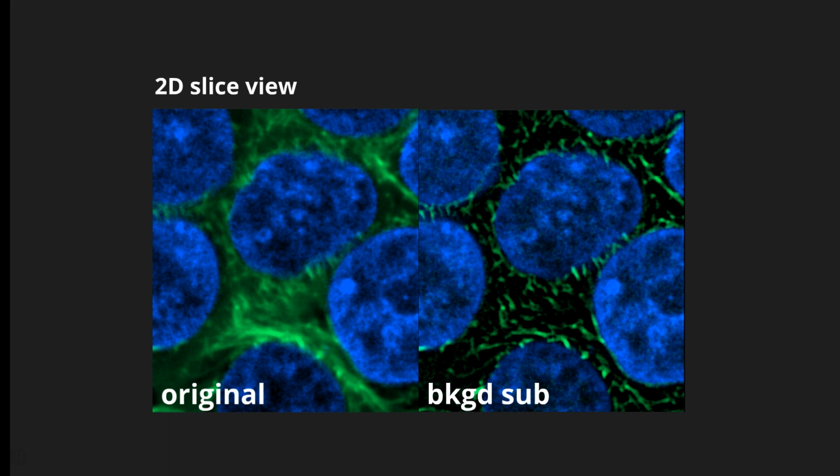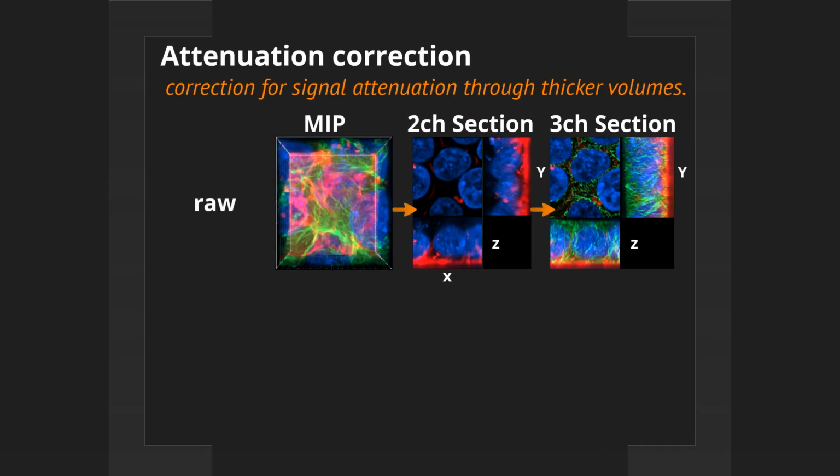And if you are using them, you have to use them consistently. You can't do it on one image and not on the other and compare the results from those two images. So I'm sure you're familiar with that. It goes all the way back to the way you prepare the sample, the way they acquire the sample. It's exactly the same for how you process and analyze the sample too. Okay. So background subtraction, I think I actually used it a couple of times with people in one-on-one sessions yesterday, so you'll probably see me continue to do so.